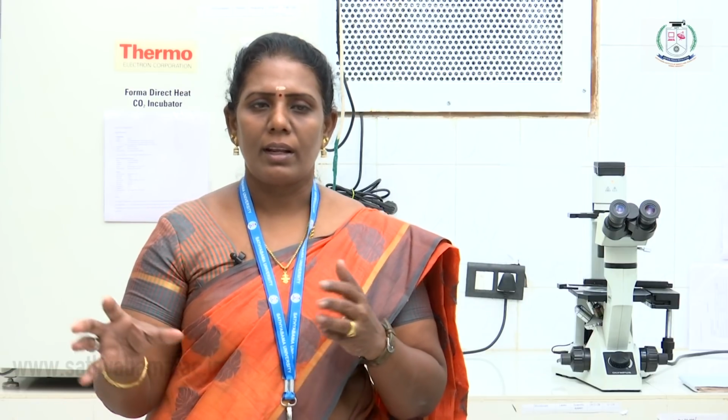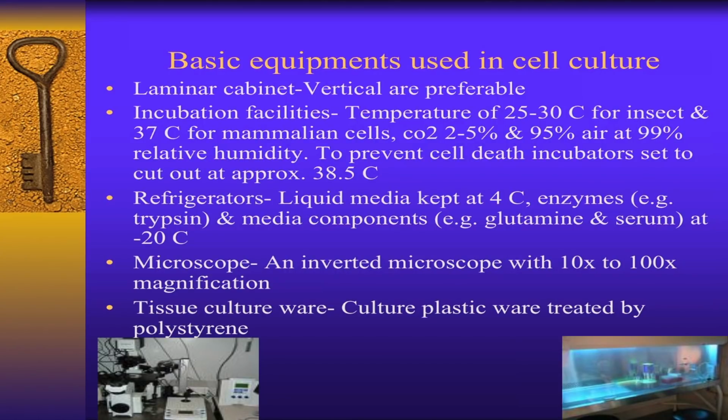So these are all the necessary basic instruments. All are high cost, but these are very important for constructing a particular cell culture laboratory. Now we should discuss the primary cell culture.